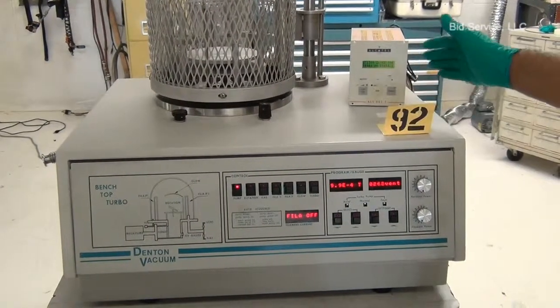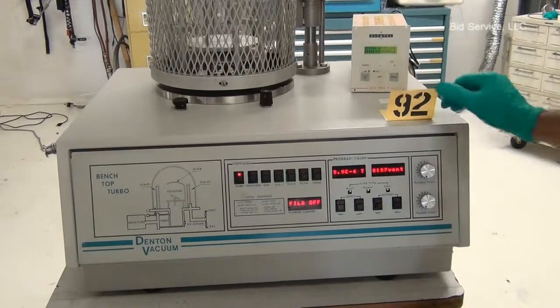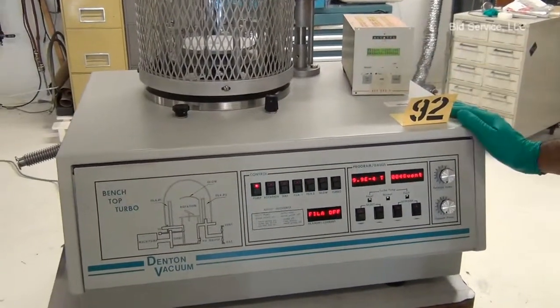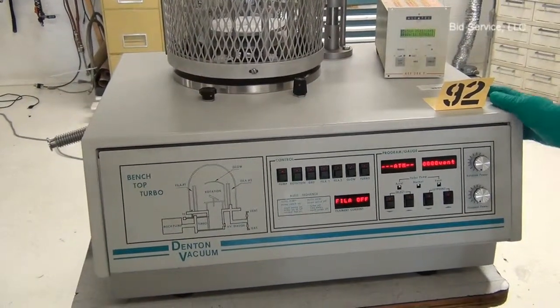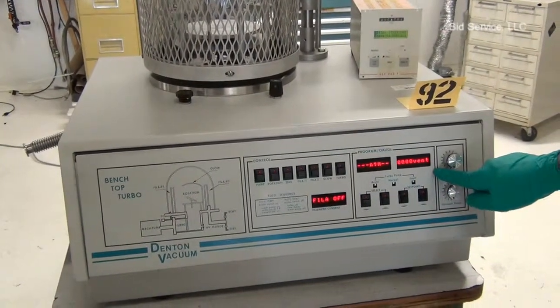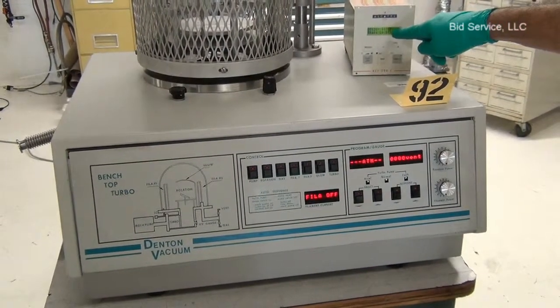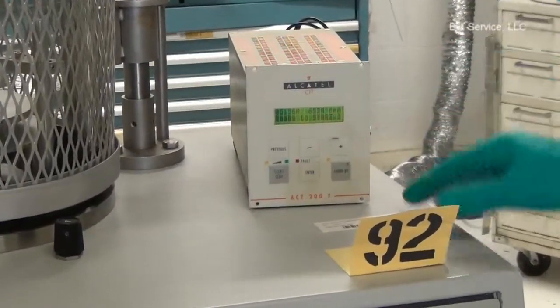The turbo pump starts decelerating. After the countdown, the vent valve will open and will enable the user to open the bell jar. Right now, the vent is in progress.